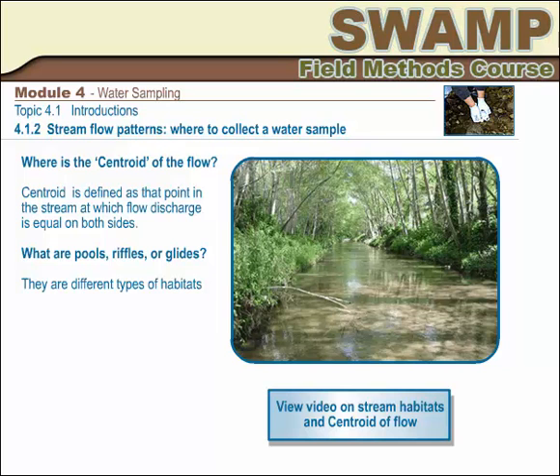The next two screens show more examples. Click the button to view a video about stream habitats, flow patterns, and the centroid of flow.